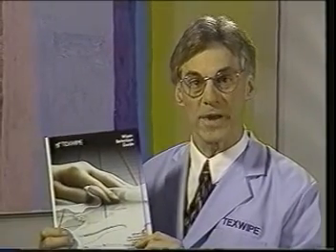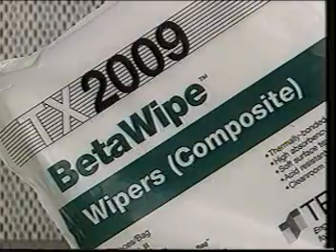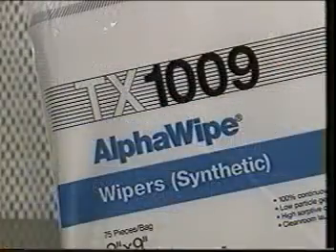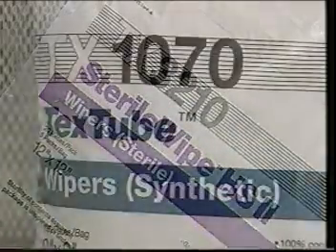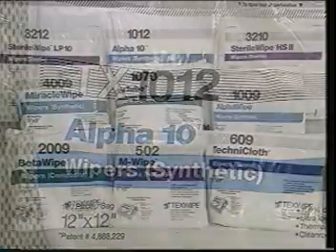To obtain the correct types of wipers for your needs, you should first consider what class of cleanroom you're working in. Texwipe publishes a selection guide to assist you in making appropriate choices. It lists the optimum wiper types for each cleanroom class. Because there's such a wide variety of wiper types from which to choose, you also need to match the characteristics inherent in different wipers to the kind of work you intend to use the wipers for.